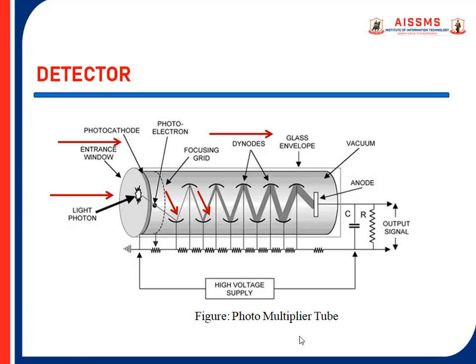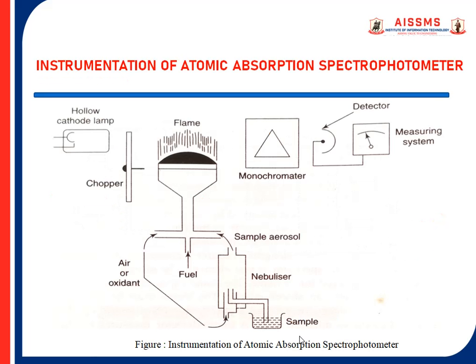After all the dynodes, the number of electrons finally reaching the anode is on the order of 10 million for each incident photon. The output of the detector is the current measured at the anode collector, which is still proportional to the intensity of the light, but it has been amplified over 1,000,000 times.